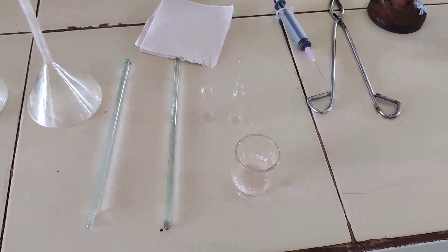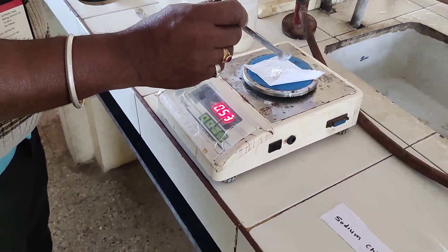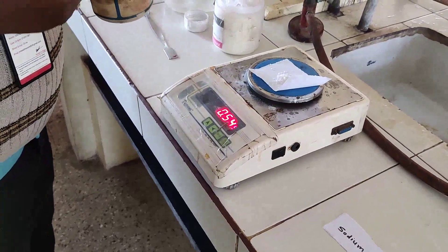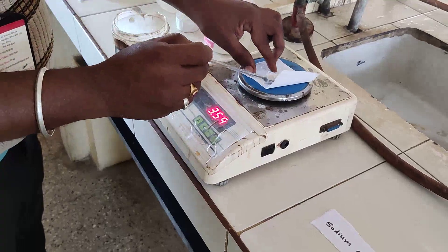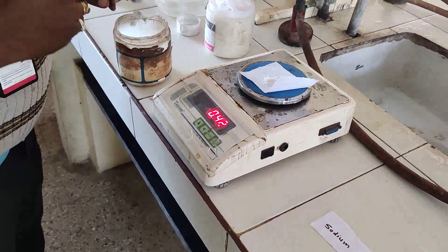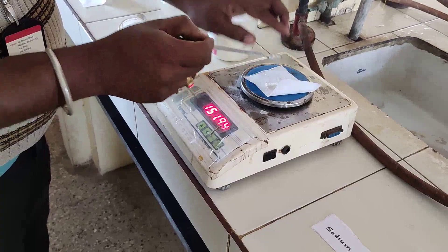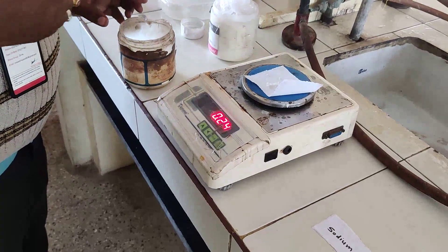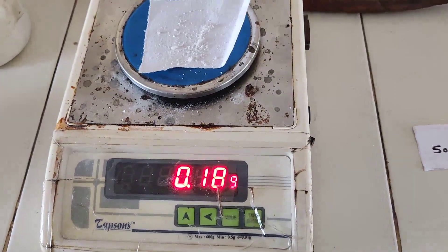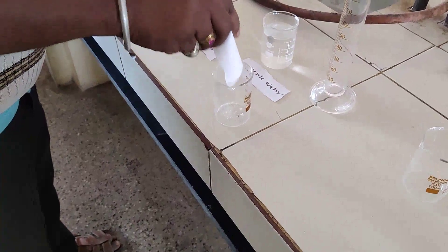We have to weigh sodium chloride. 180 mg of sodium chloride is required to fill two ampules, each containing 10 ml of sodium chloride solution. So we have to take 180 mg of sodium chloride.